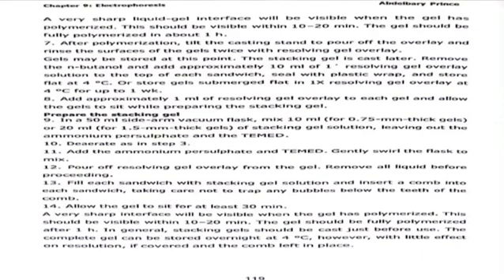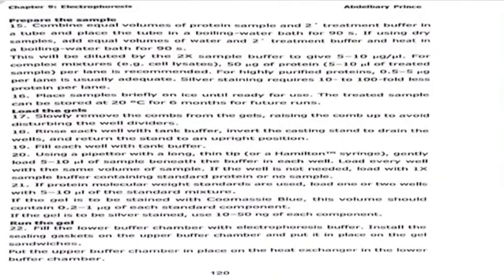14. Allow the gel to set for at least 30 minutes. A very sharp interface will be visible when the gel has polymerized. This should be visible within 10 to 20 minutes. The gel should be fully polymerized after 1 hour. In general, stacking gels should be cast just before use. The complete gel can be stored overnight at 4 degrees Celsius, however, with little effect on resolution if covered and the comb left in place.